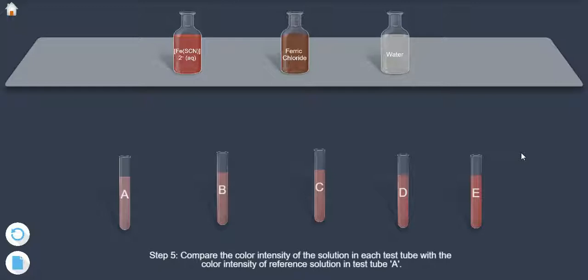Step 5. Compare the color intensity of the solution in each test tube with the color intensity of reference solution in test tube A.